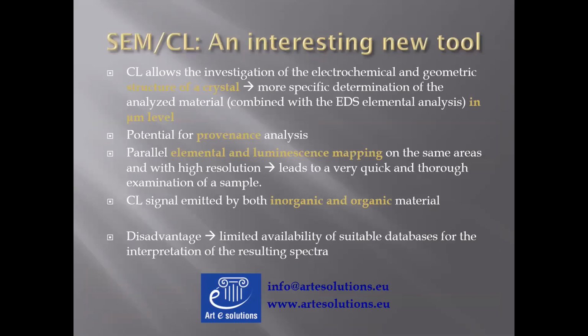So all in all the work that we have done so far with this technique suggests that it can be very, very useful in cultural heritage, specifically the fact that we have a combination of elemental analysis and the luminescent analysis, which directly shows information about the structure of the crystal. And of course, the fact that all of that is done at micrometer level, so we have a very, very high resolution.